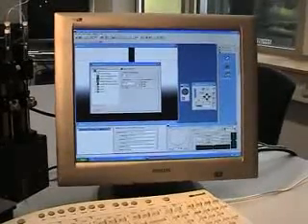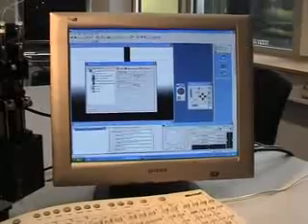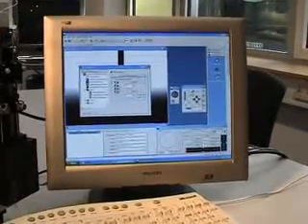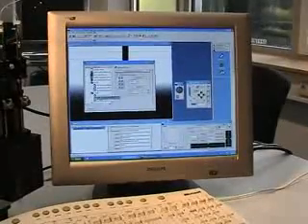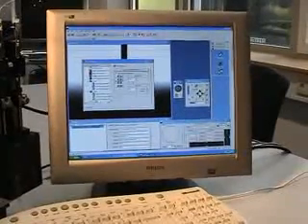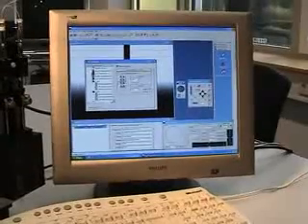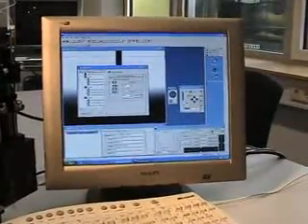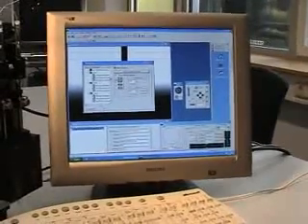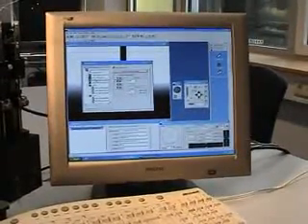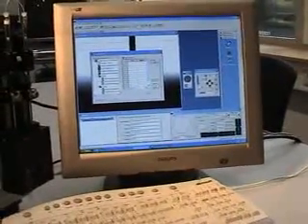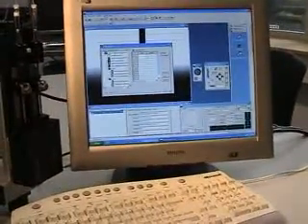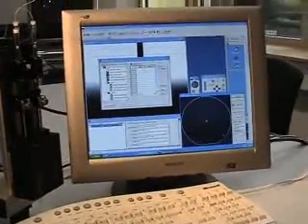Defining the syringes for the liquids, where we can choose up to four different liquids. Also the volumes and dosing rates.